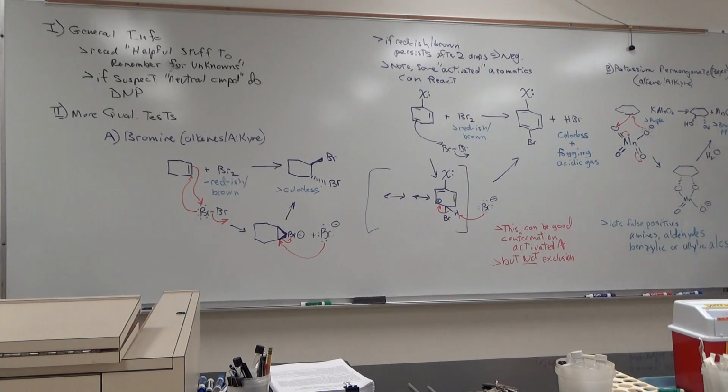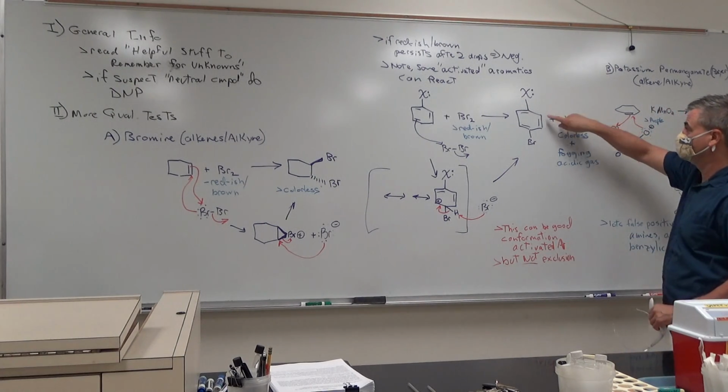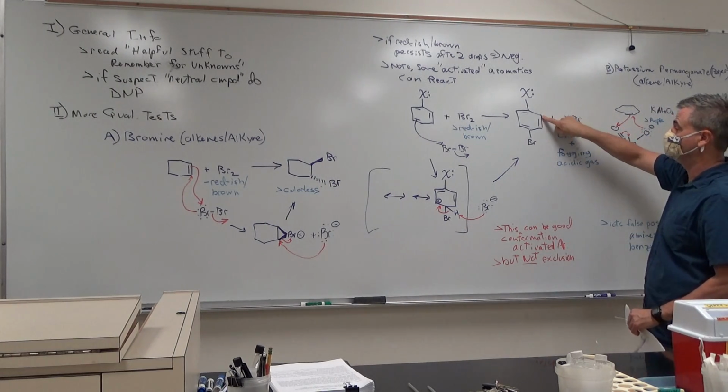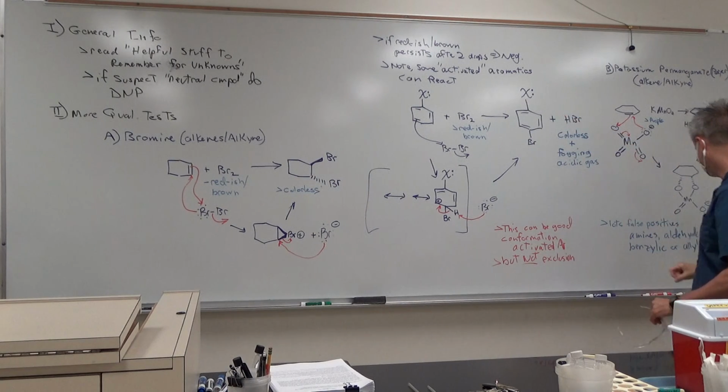Okay. Do you remember what benzylic or allylic means? A benzylic alcohol would be an alcohol where the OH is not on the aromatic ring itself, but on one carbon removed. Okay? It's right here. Then it can react with potassium permanganate. Aldehydes, certainly. Amines, certainly. So forth.